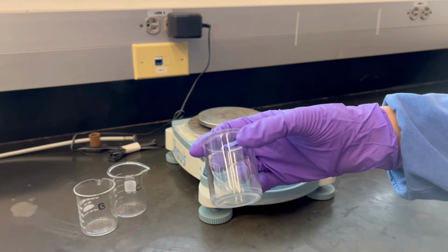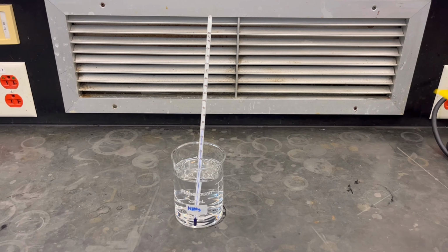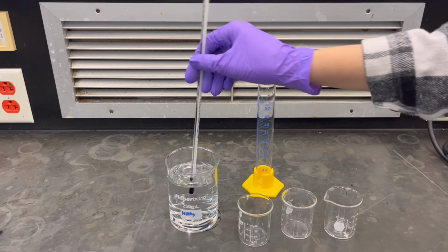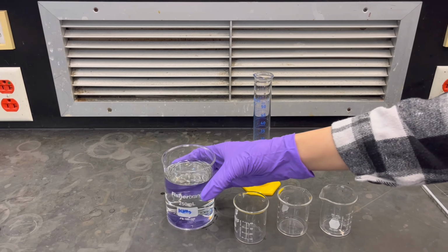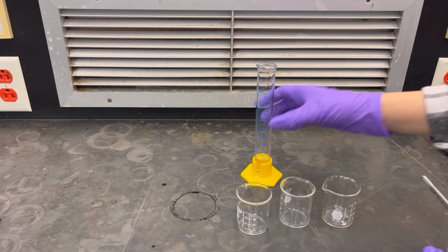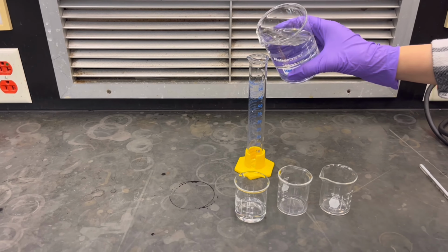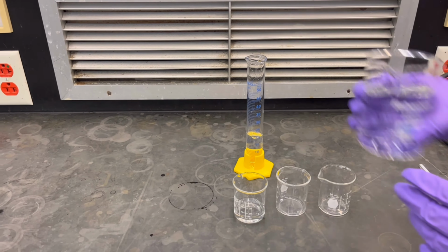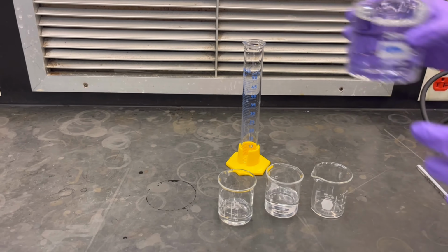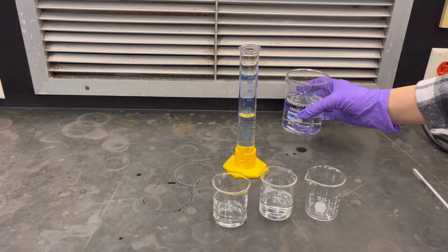After recording the density, we will mark the 3 beakers with A, B, and C. After marking them, we're going to go to the balance and measure the mass of the empty beakers. After measuring the mass for the 3 beakers, we're going to get our graduated cylinder and the DI water that we had left for 5 minutes. We'll remove our thermometer, and then for beaker A, we'll obtain 10 milliliters of water. For beaker B, we're going to obtain 20 milliliters of water. And finally, we're going to obtain 30 milliliters of water for our 3rd beaker, which is beaker C.